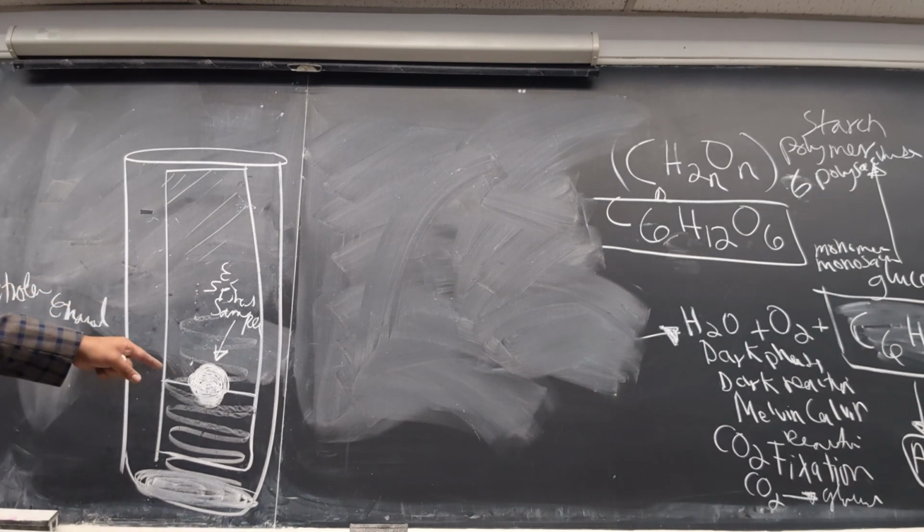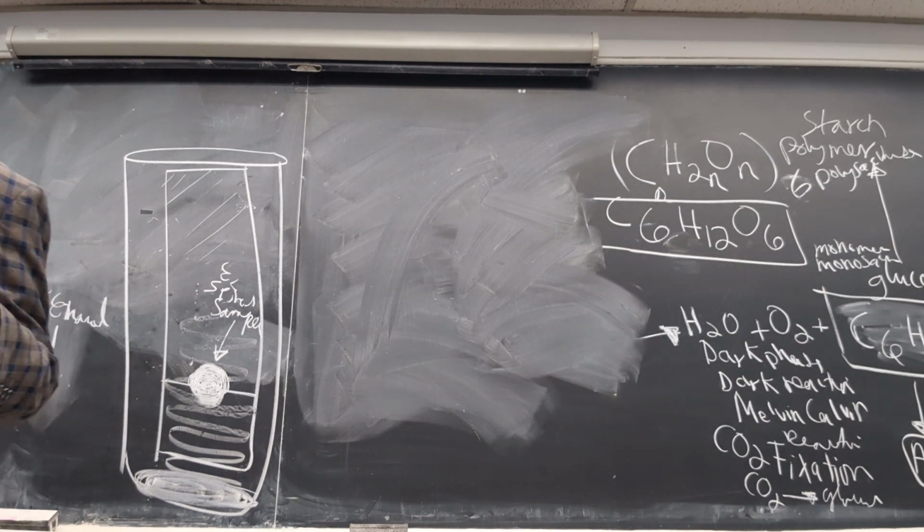Then, also we know that the petroleum ether is what kind of solvent? Is it a polar solvent or a non-polar solvent? Petroleum ether. No. That's non-polar. So that means it will only dissolve who? Non-polar.